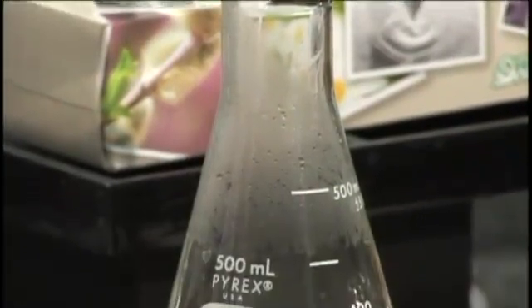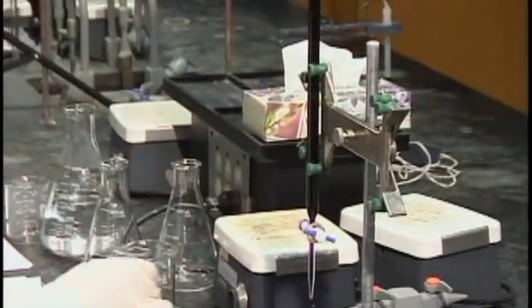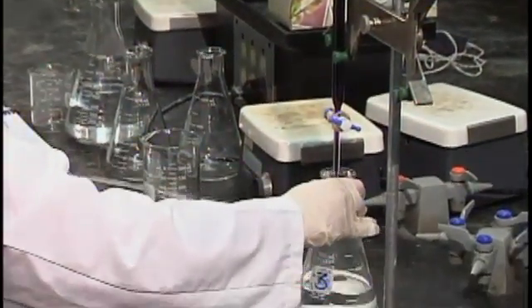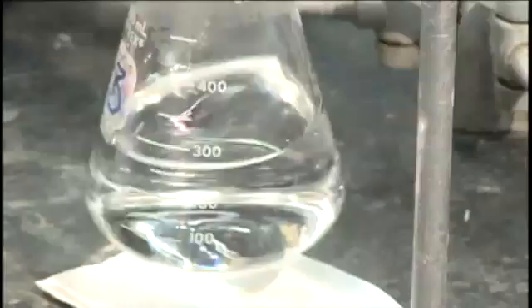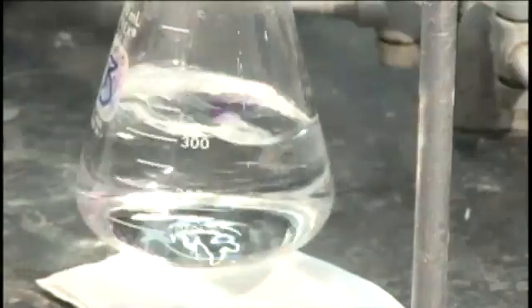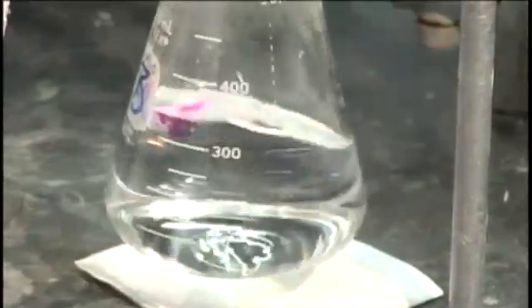All right, so we're at 58 degrees, so we can continue our titration drop by drop until our solution turns pale pink in color. It might be easier to see the pink color if you put a small white piece of paper or a Kleenex underneath your beaker.